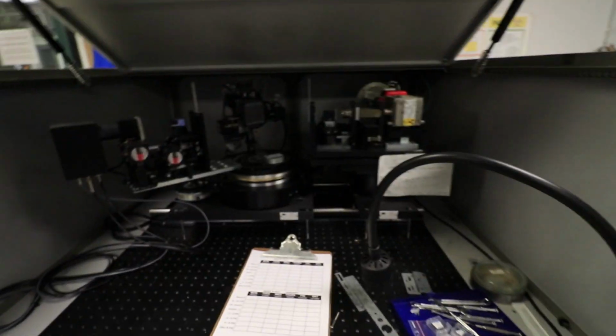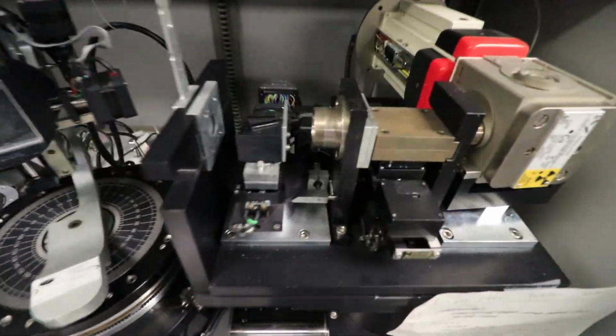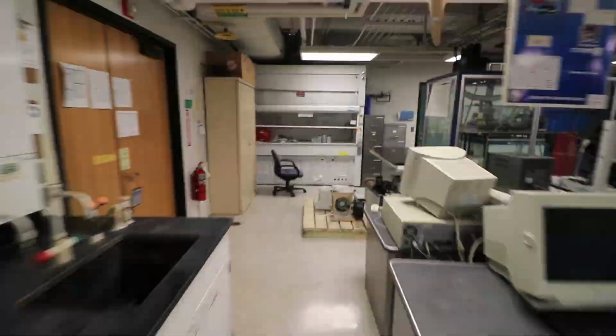This BD1 system is used for more complex analytical scans and allows the main system in the clean room to better support the growth. By having a second system, we can do 24-hour scans or triple-axis scans to acquire high-resolution reciprocal space maps. Now, moving across the lab back to the other side, we have a second support chase.